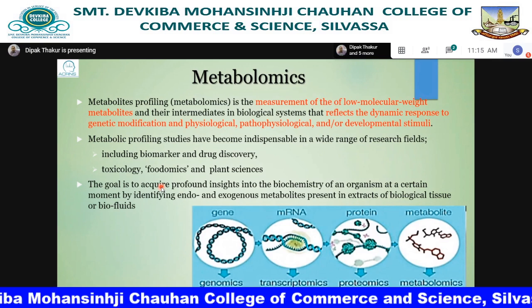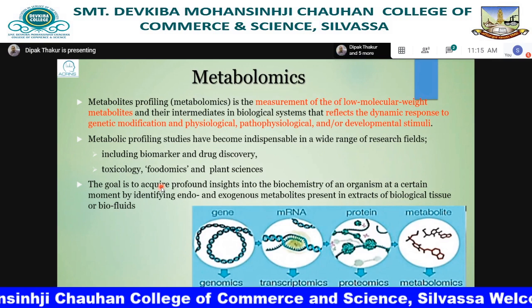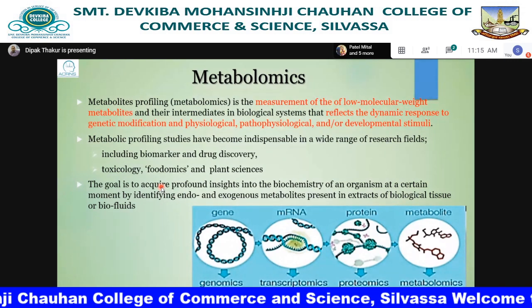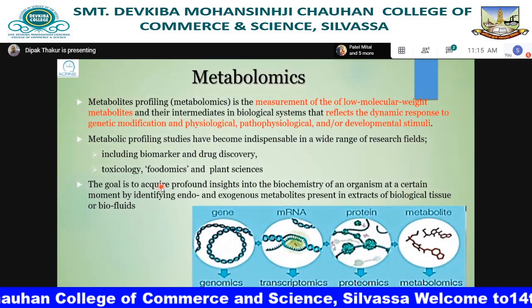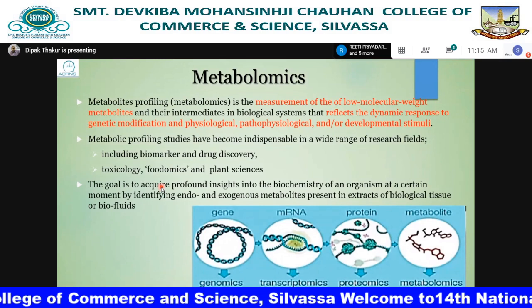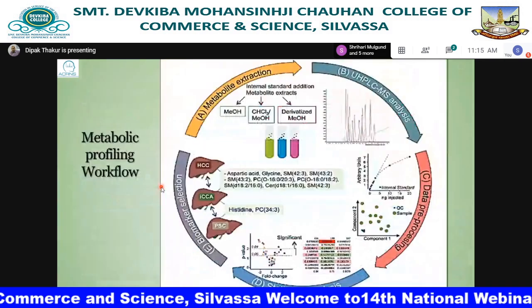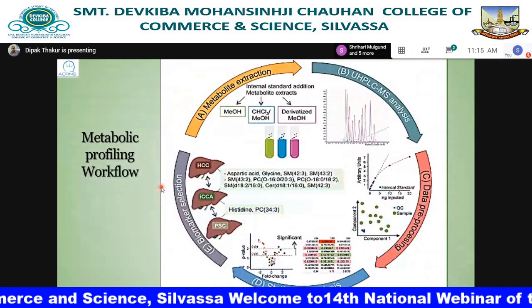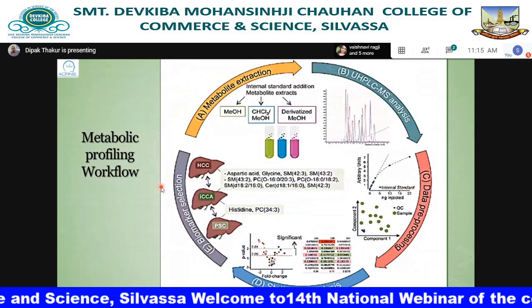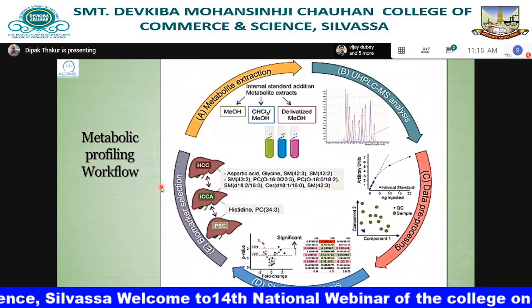So the goal is to acquire profound insights into biochemistry of an organism at a certain moment by identifying endogenous and exogenous metabolites present in the extract of biological tissue or biofluids. This is what the general metabolite profiling workflow is. First thing is extraction of metabolites.